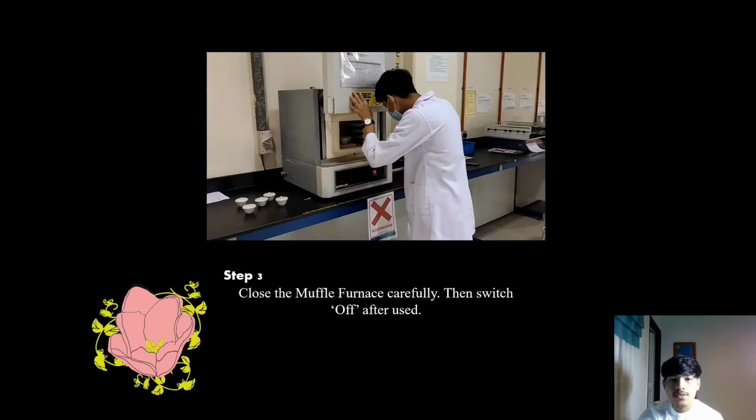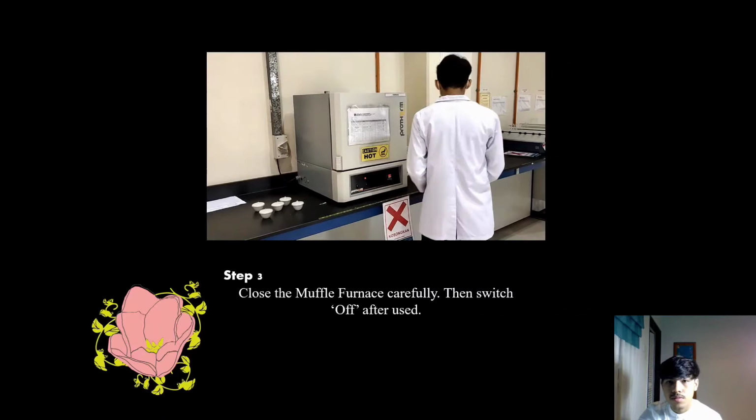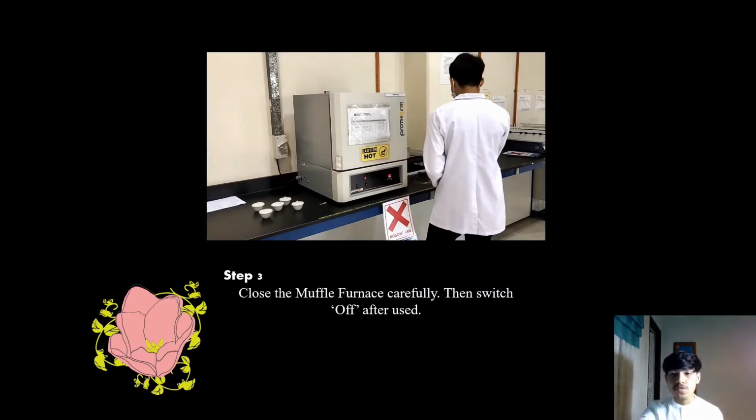Step 3. Close the muffle furnace carefully. Then switch off after use. Okay, that's all from me.